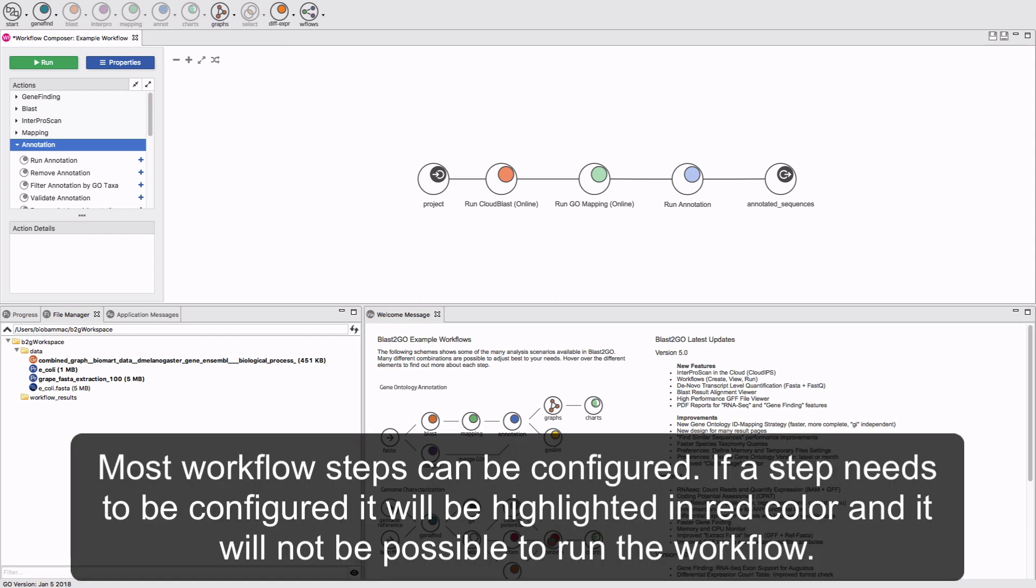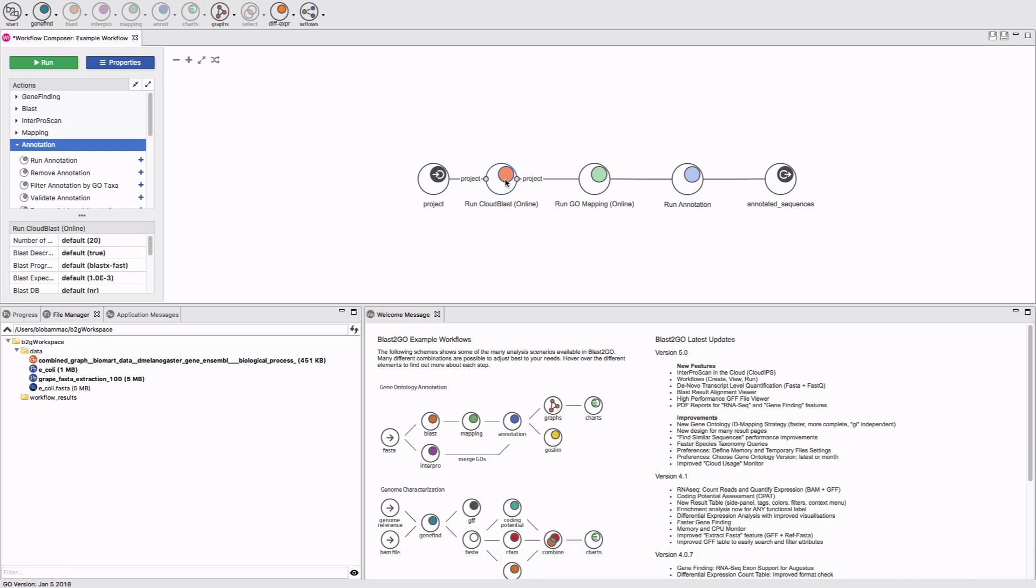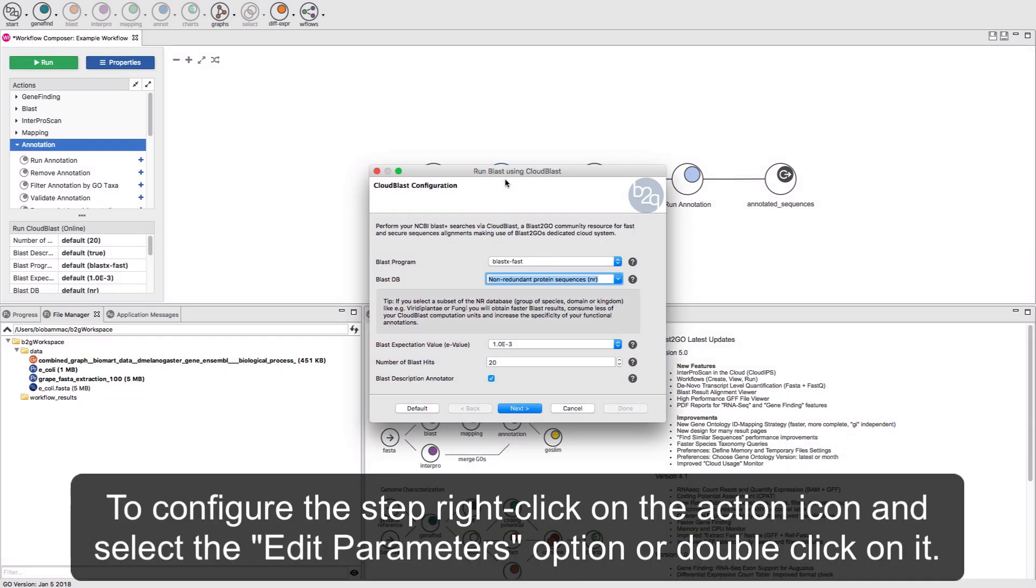Most workflow steps can be configured. If a step needs to be configured, it will be highlighted in a red color, and it will not be possible to run the workflow. To configure the step, right-click on the action icon and select the Edit Parameters option or double-click on it.